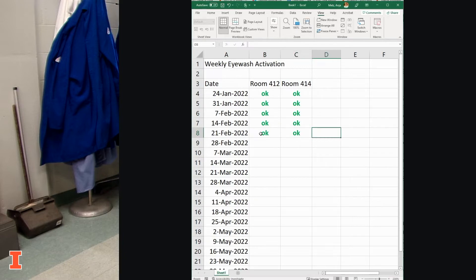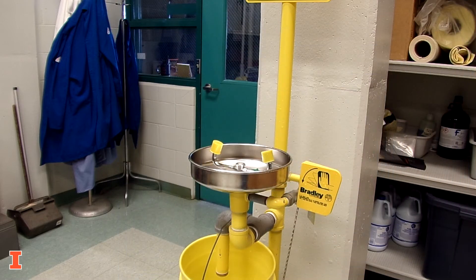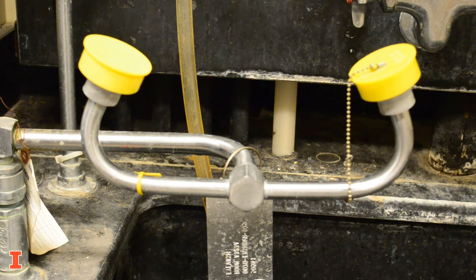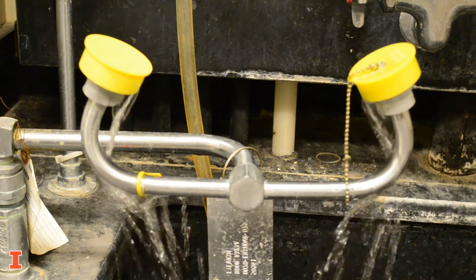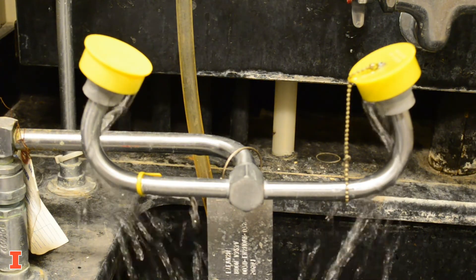Inform your building manager if the eyewash is not functioning properly. For example, if the pressure is not sufficient to remove the caps, if the water streams are uneven, or if you notice extreme temperature swings.